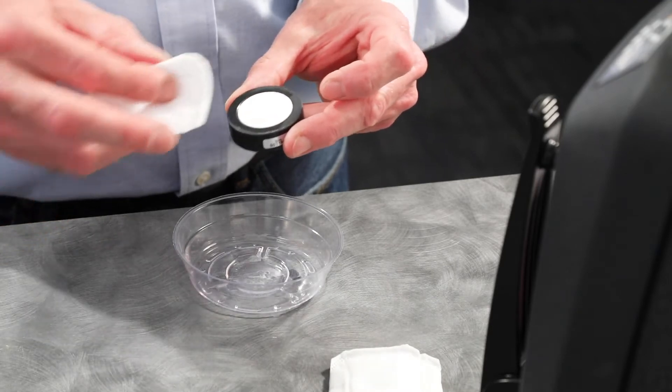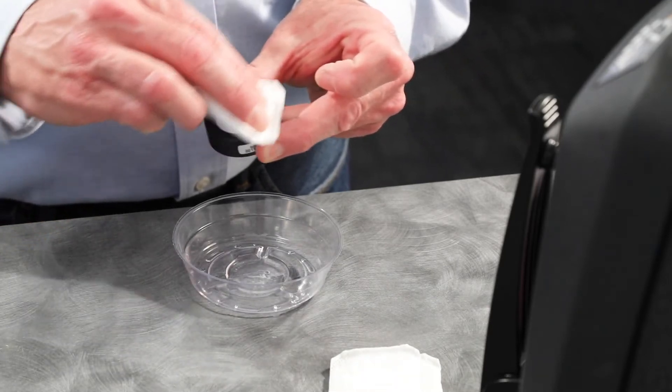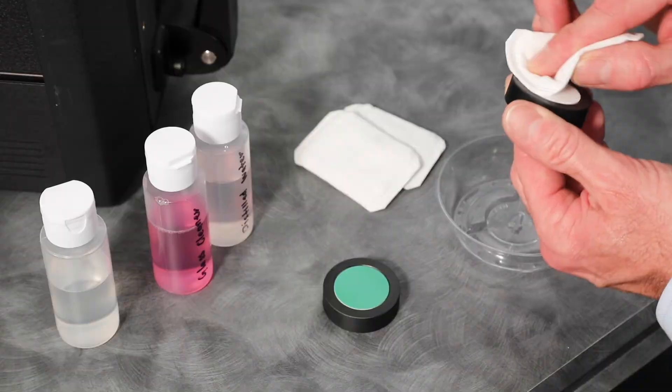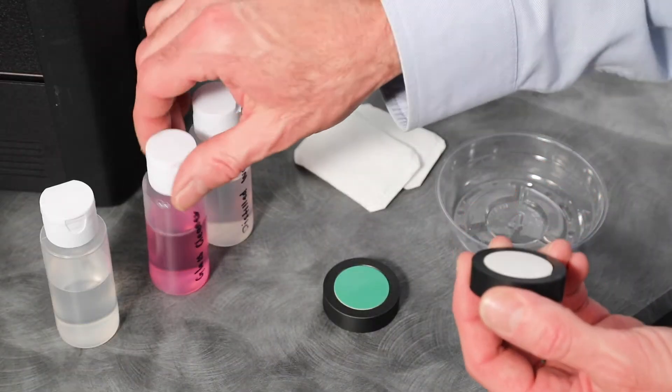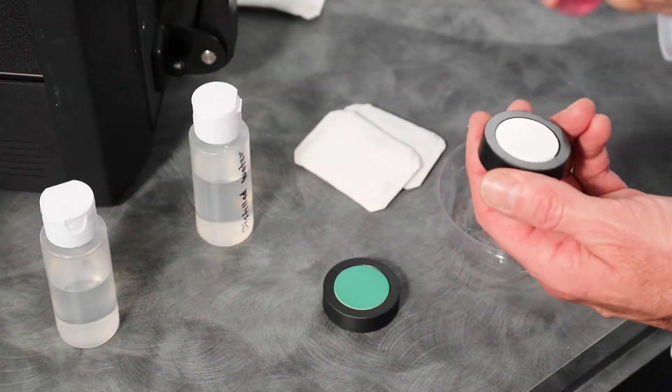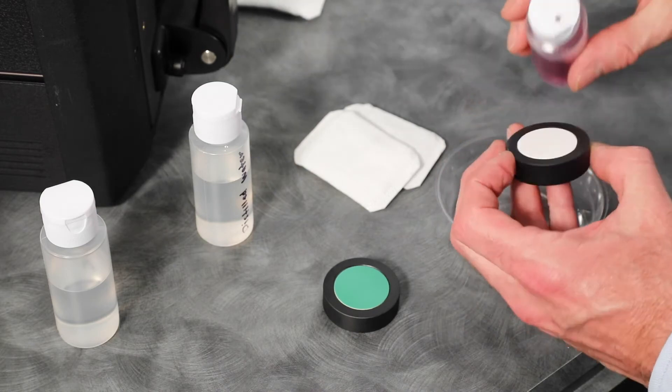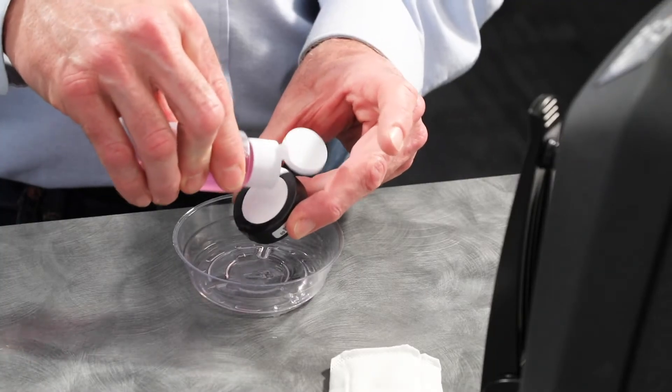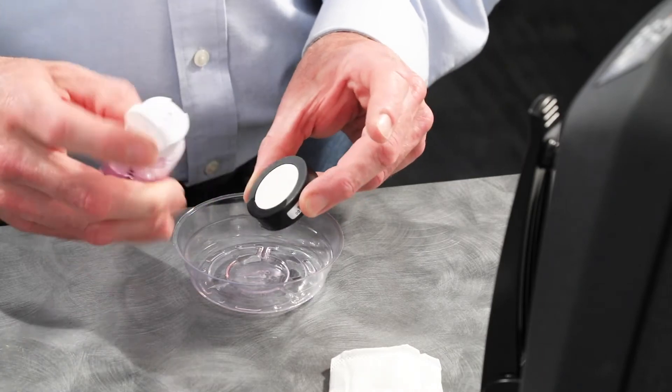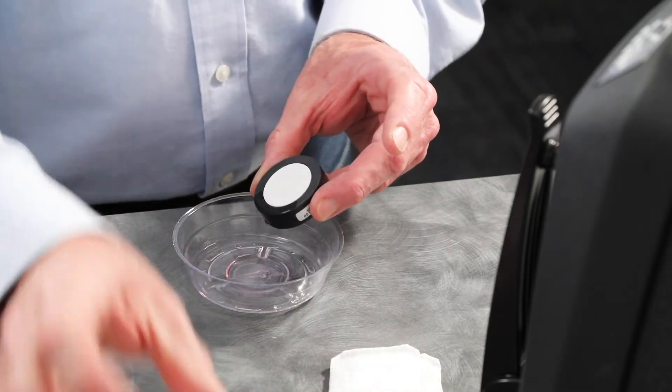Then use a dry portion of the wipe until the surface is dry. Next, apply the glass cleaner onto the surface of the tile. Use a new wipe to clean the entire surface.